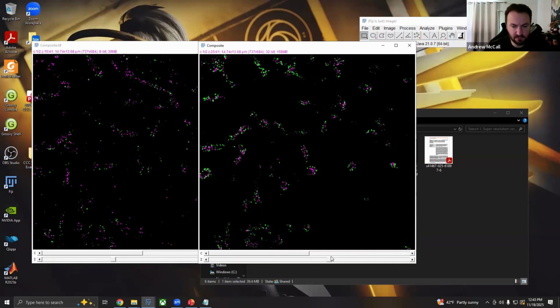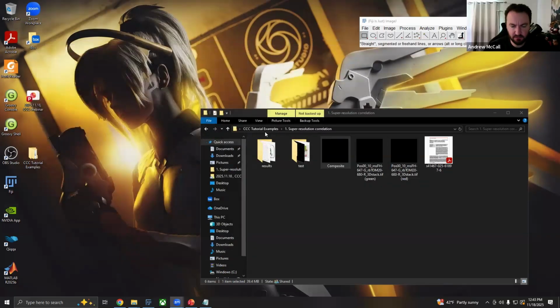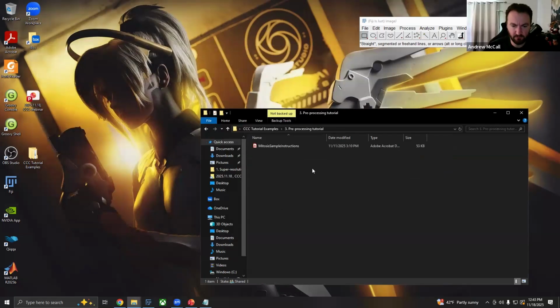So the relative intensity can matter. It is very tricky to identify, but mostly the localization is what you may want to be analyzing here. Okay, does that answer your question? Awesome. Okay. Yeah, the contribution images, they're a little bit confusing, especially at first, but not too bad.